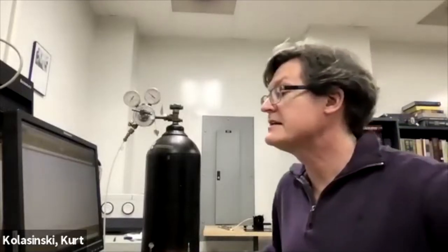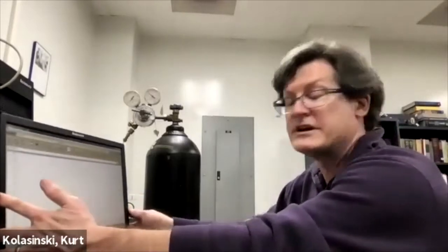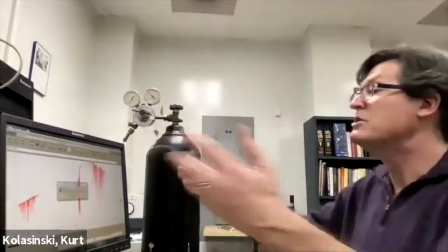We'll collect the background. Even though it takes that first spectrum, it doesn't show you anything yet on the screen, because it takes at least 4 spectra. It has to add them together before it displays anything. So don't be surprised when it doesn't display anything at first. And then they start to show up. Boom. And now we're going to collect the sample.